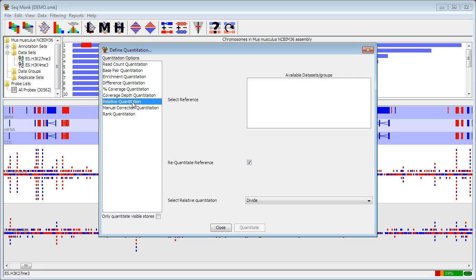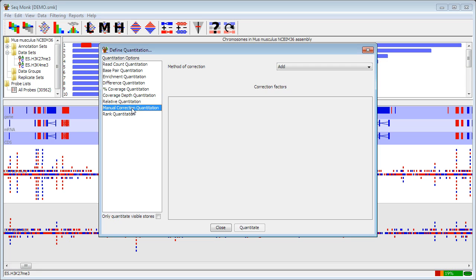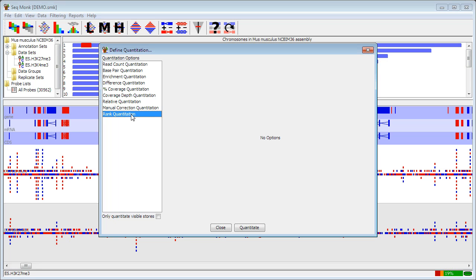And then the last few are slightly specialized again. Relative quantitation allows you to correct an existing quantitative data set using one data set as a reference. So it's useful for input versus enriched type experiments where you can correct the enriched sample by the input. Manual correction just allows you to bring in external correction factors that you've calculated outside the program and apply them to your data. And rank quantitation just instead of quantitating on a sliding scale orders your data and converts the quantitations to ranks.